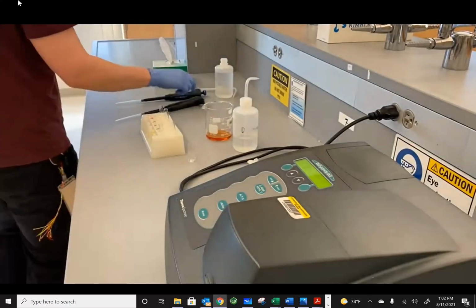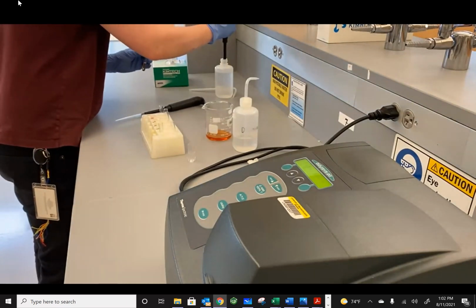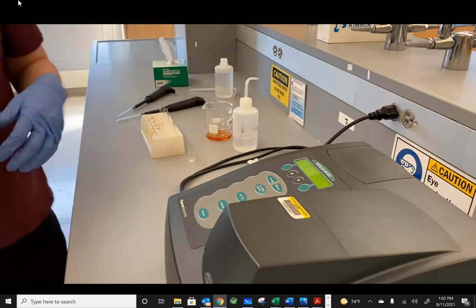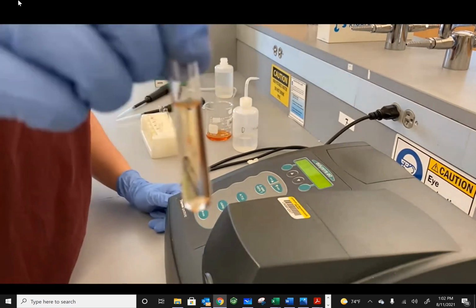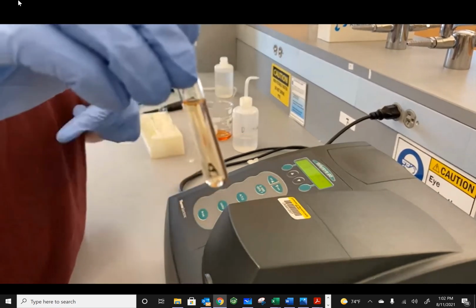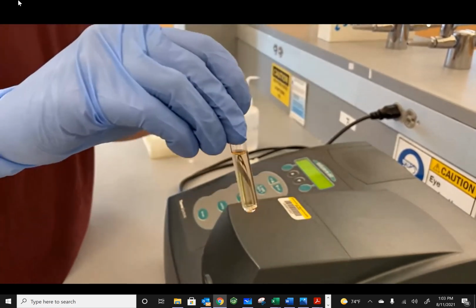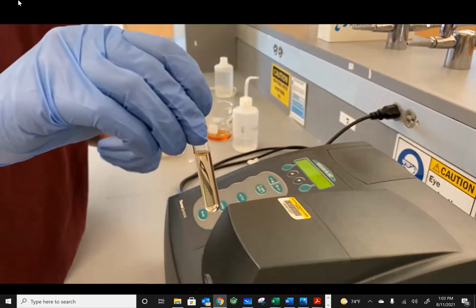Now, because we are doing a standard concentration study, we need to make sure that in each of our test tubes, we have the same volume, so we keep our same concentration of metal. For that purpose, we are going to backfill with water. Now, in this particular example, you can find all of the test tube measurements, so the amounts of liquid that you put in each one, in table 1 in your lab notebook. It's right in the experimental section.